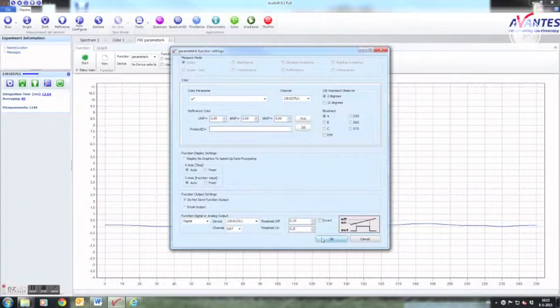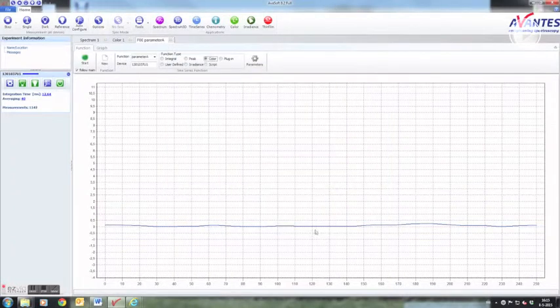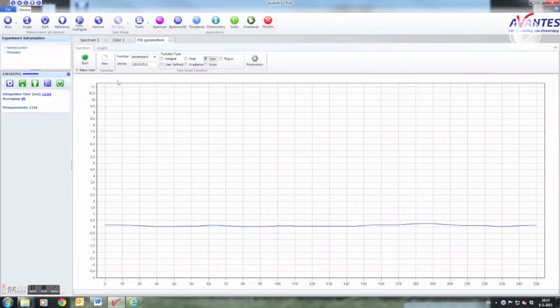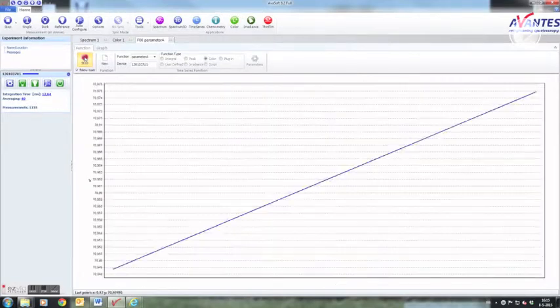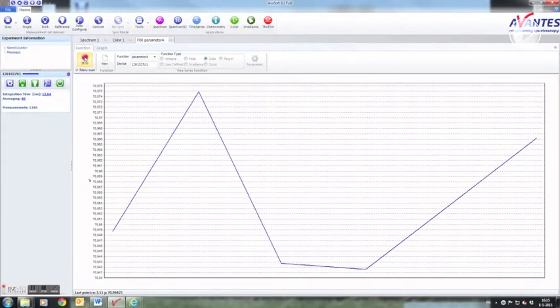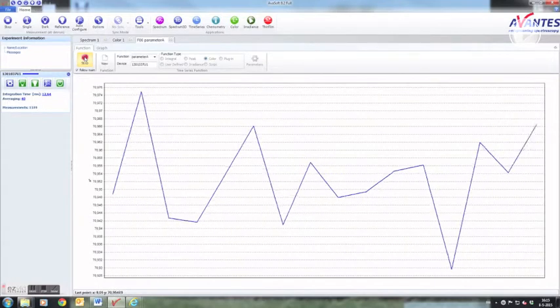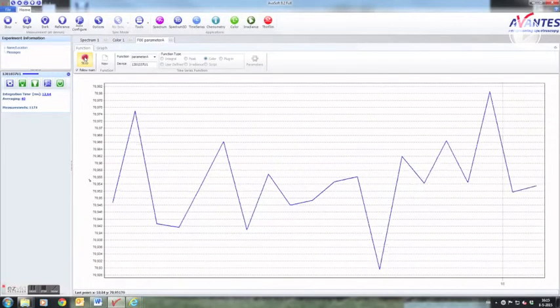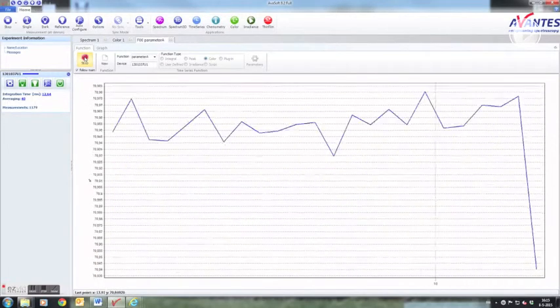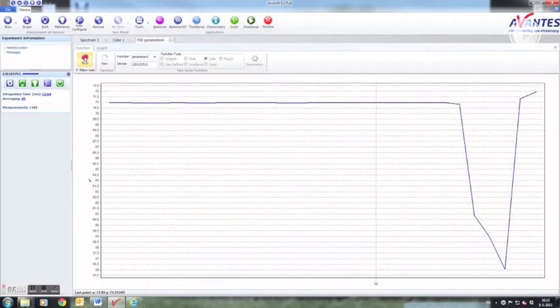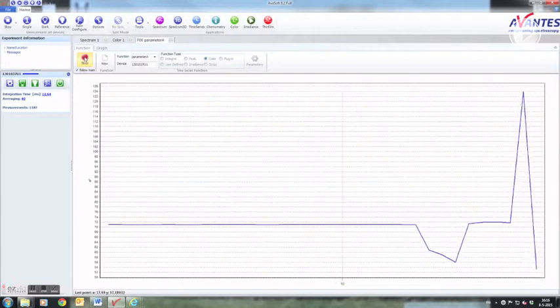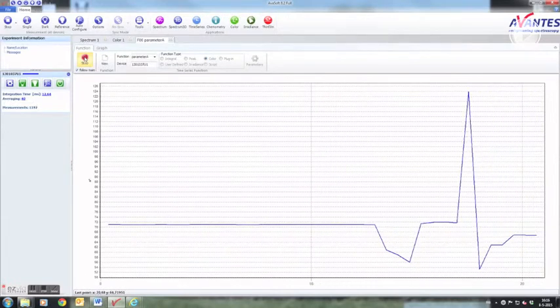After pressing OK the function is defined. Just press start to begin recording. Data will follow until stop is pressed.